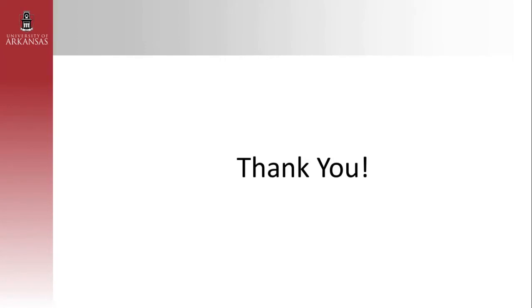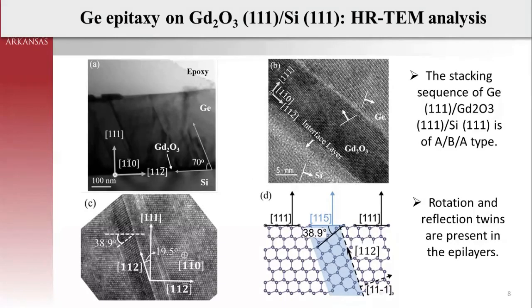But what I try to send as a message to all the audience who are listening, basically who are starting their career with electron microscopy, I would advise you to look into how powerful electron microscopy characterization is when you combine it with other structural characterizations like XRD, or if you have the facility, even with reflection high energy electron diffraction.